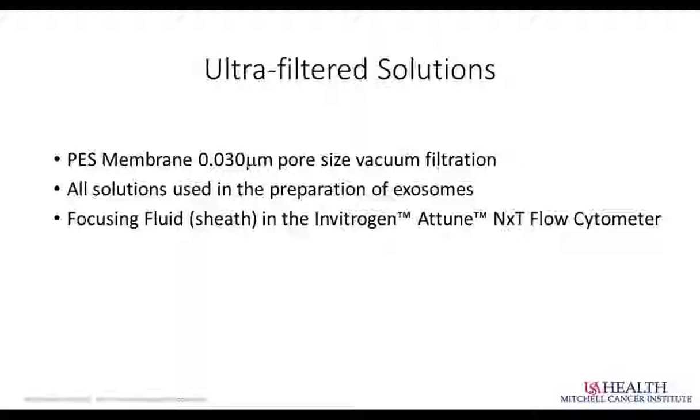So early on, when we started working with exosomes and trying to do flow cytometry with them, we came up with an idea to use ultrafiltered solutions to reduce the burden of debris in those solutions that we use to prepare the exosomes, and also in the actual focusing fluid or sheath fluid that runs through the flow cytometer, which helps us to improve background noise.